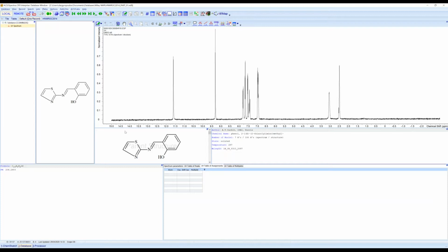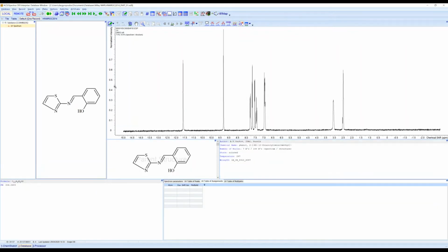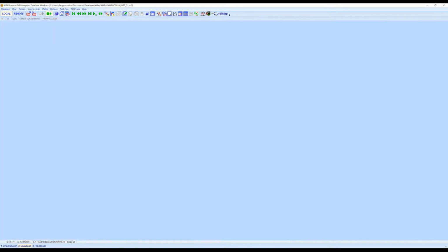What I want to emphasize at this point is that this screen is fully customizable. So I can not only expand and move these things around, if my mouse behaves. Okay, but you can also use our tools and create your own custom screen forms, as we refer to them, and make it look exactly the way you want it with exactly the information you want. For this reason, Wiley is actually providing this screen form here. And if I select it, you can see, in a much more compact view, what you want.